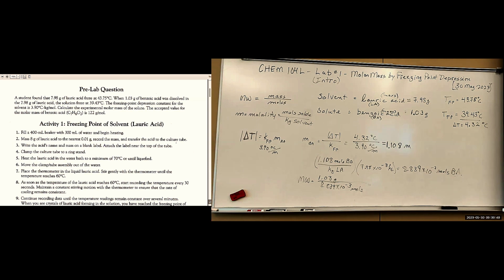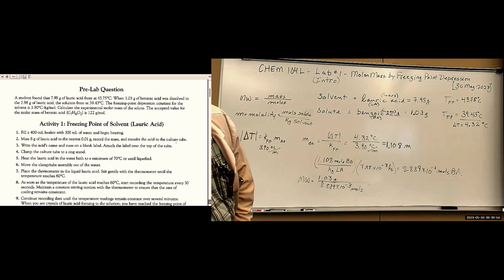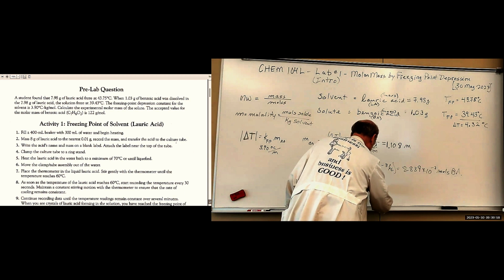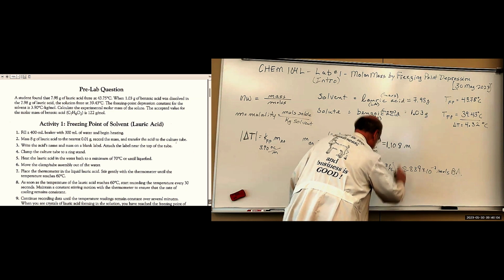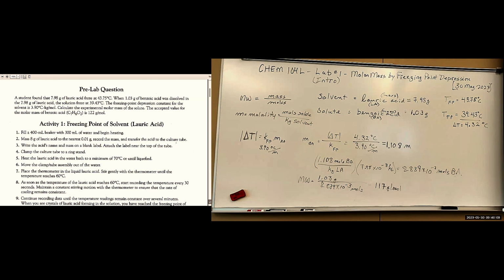Okay, I get, rounded off, 117 grams per mole.